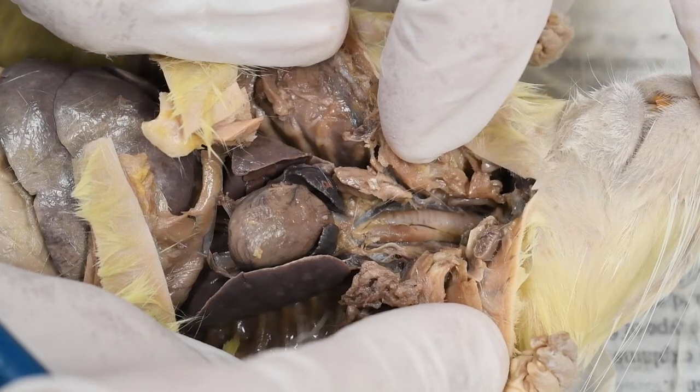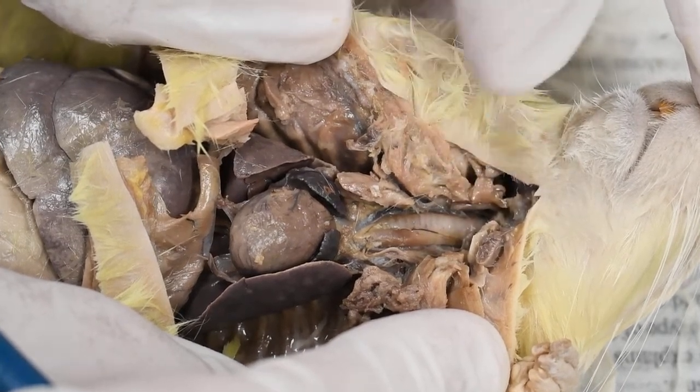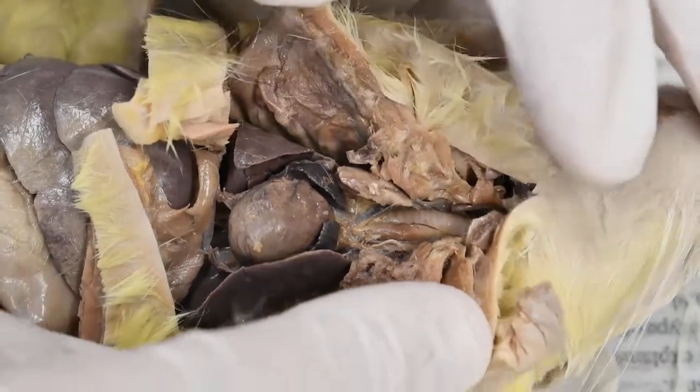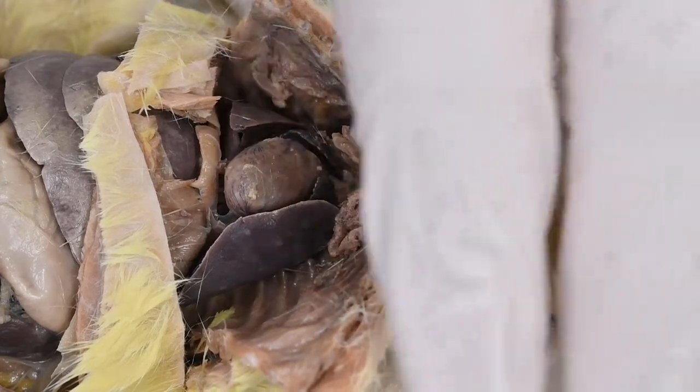Those rings are cartilage, and that's the trachea. So that brings air from the mouth down into the lungs. Okay, so now let's take a look at the digestive tract.